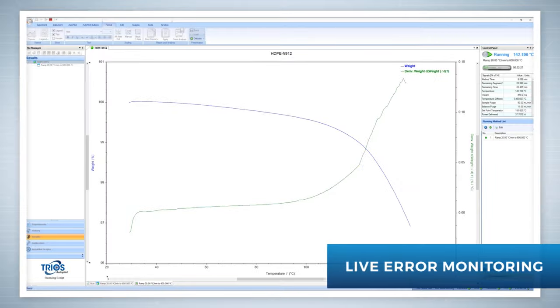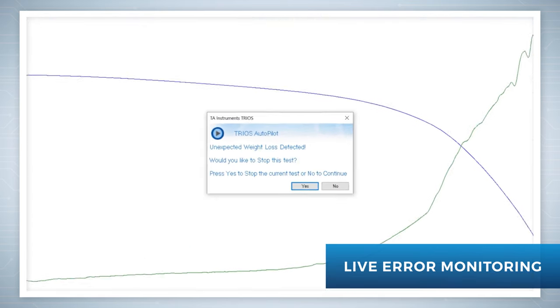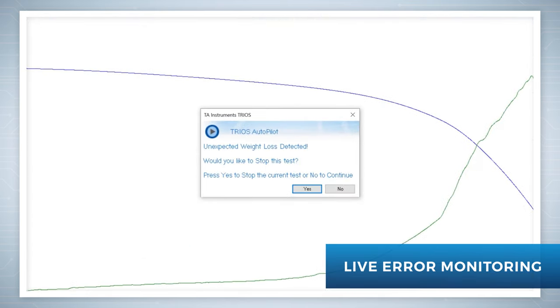Autopilot features live error monitoring to alert you of an experiment that may not give the desired results. Detect abnormalities and dynamically adjust during the test, not after.